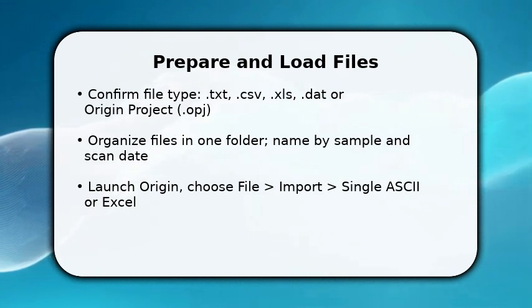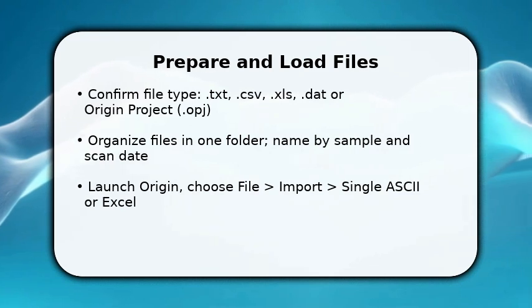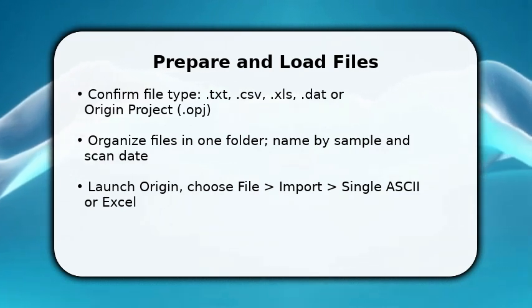Make sure header rows and delimiters are clear, otherwise Origin may misassign columns. Once the first file loads correctly, you'll be ready to run a repeatable import for the remaining scans.